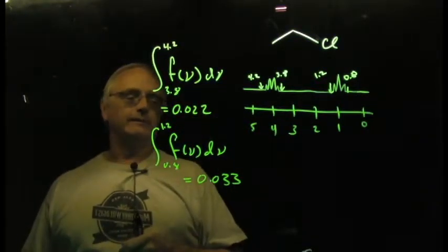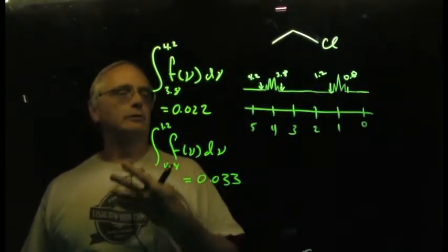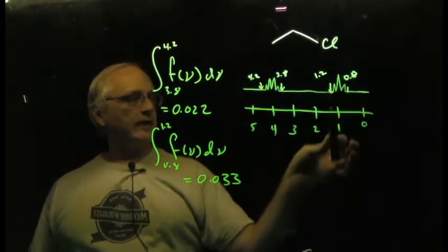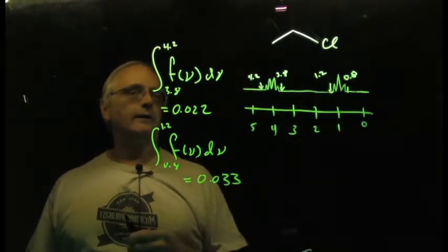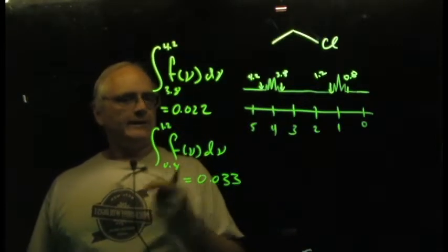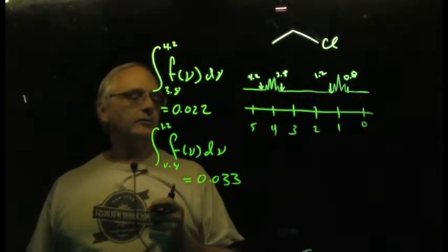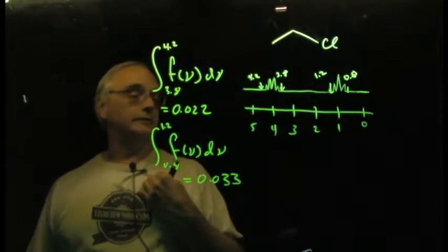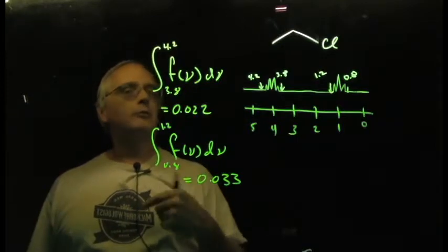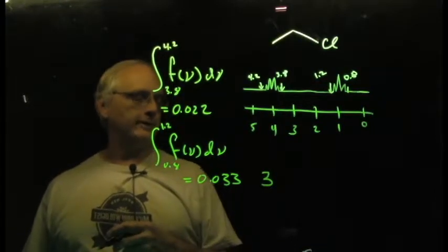So we scale these numbers to the nearest whole numbers. And furthermore, and this is what you start to learn as you interpret many spectra, groups that show up in this area with a chemical shift, we call it, of around 1 ppm, are often, it's not a guarantee, but are often methyl groups. Okay? And so I'm going to use my chemical intuition and say this integration around 1 that came out to this value probably actually represents 3, a methyl group, a group with 3 protons in it.